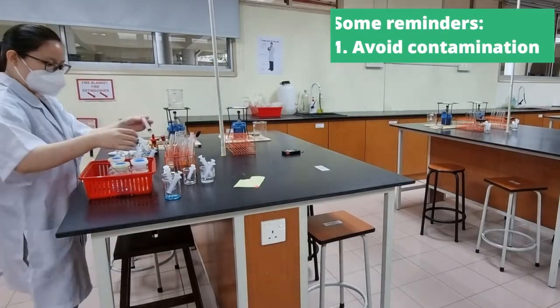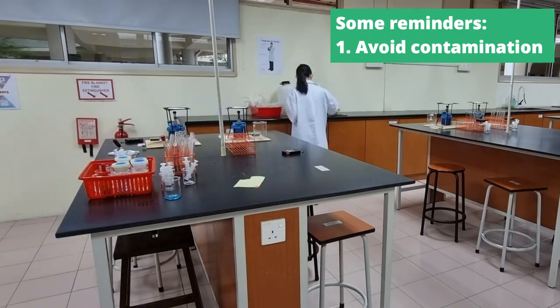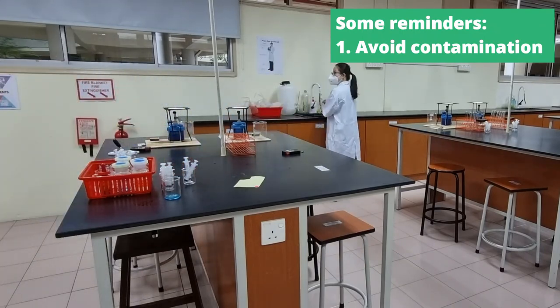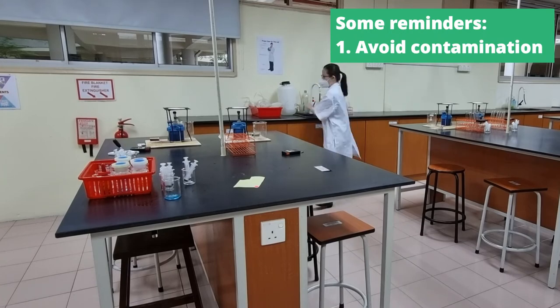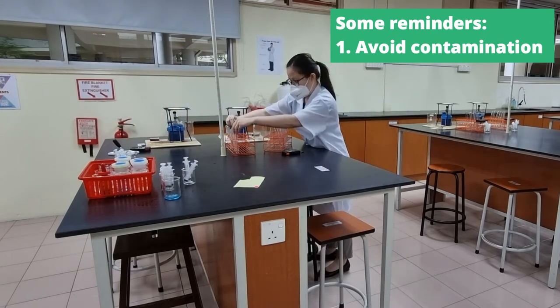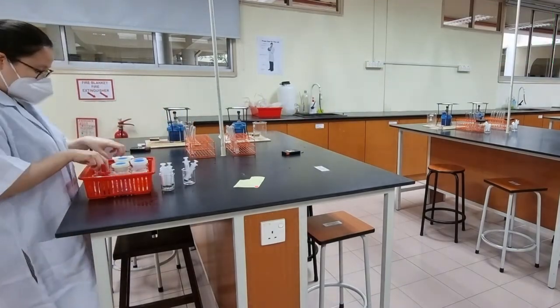While you look at me clean up the lab, just a few reminders before we end. Number one, in these kinds of experiments, it's very important to avoid contamination, so make sure you're using a clean syringe in order to pick up a solution, and use a designated syringe for the designated solution as much as you possibly can.